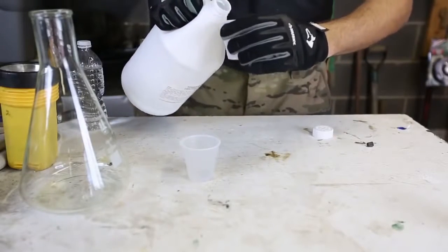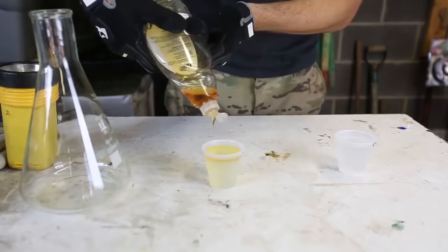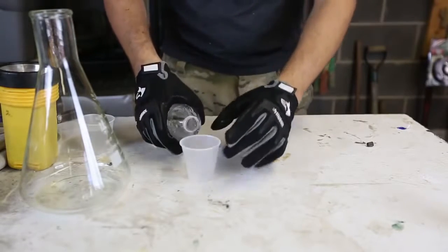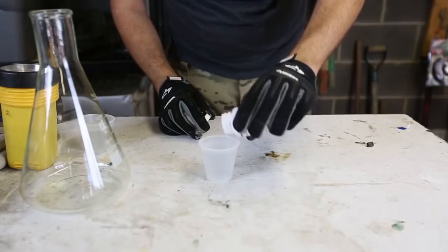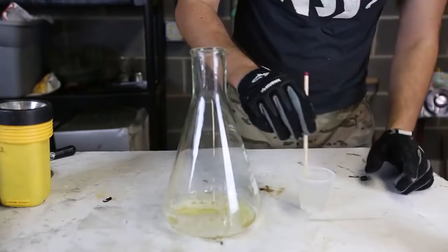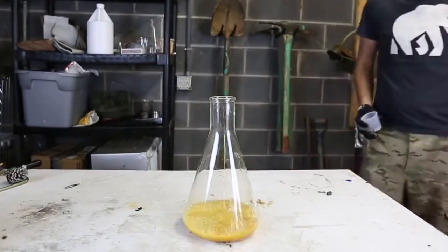First we're gonna get hydrogen peroxide, 35%, and fill up the glass just like this. Boom. And then we're gonna set this aside. Also we're gonna pour some soap into the hydrogen peroxide and mix it all up. Then we're gonna fill up another cup with water and we're gonna be using potassium iodide. Pour a little bit of that, crystals. Just like that. Then we're gonna grab one of these and pour this peroxide with soap. Boom, just like that. Potassium iodide with water needs to be mixed up really well as well. Now we're going to get the potassium iodide solution and mix it together. And let's see what happens.